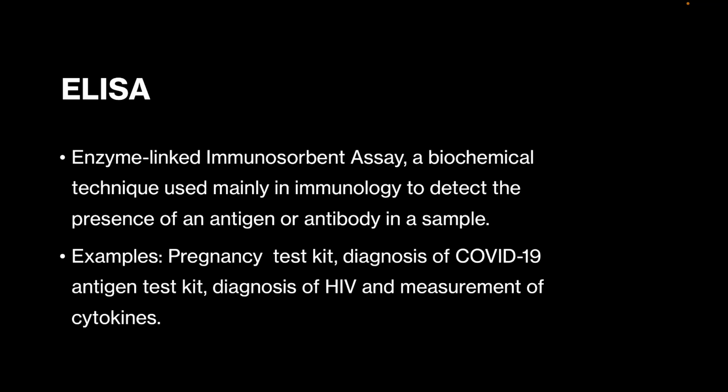In the test kit, they have antibodies against this protein. Antibodies only bind to a particular antigen, like they have specificity for a particular protein. So in the pregnancy test kit, the antibody is specific for the protein HCG, which is only formed during pregnancy.